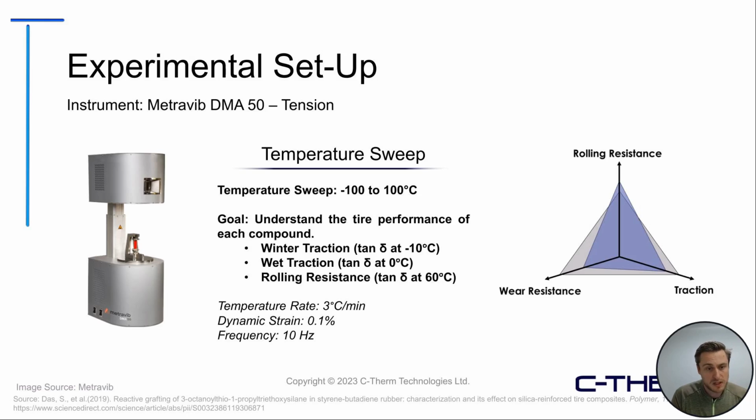And for those who don't know, DMA has a lot of success in the tire industry due to the fact that it can evaluate the performance of tires with key performance indicators.